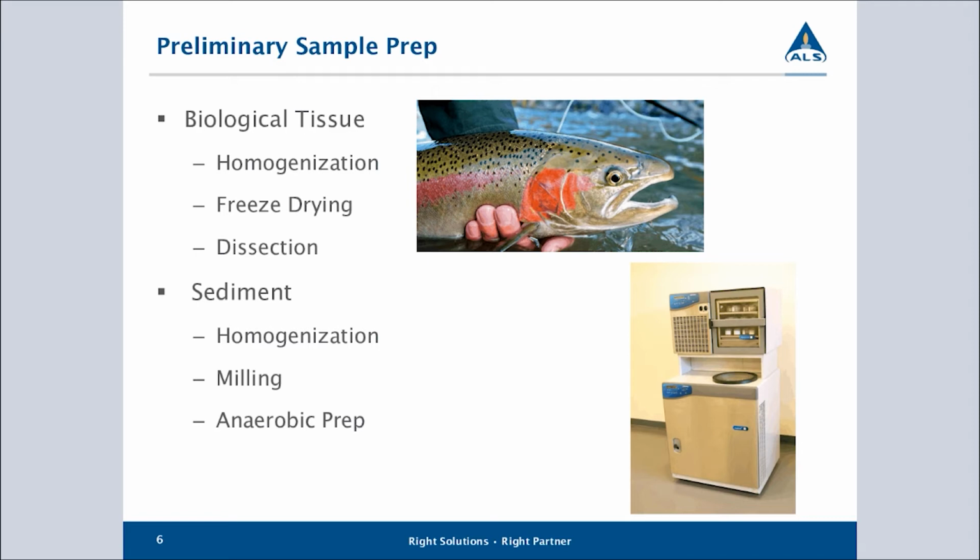Sediment samples are generally mixed in the received container, but we'll also put them in a larger container to get better mixing, particularly of supernatant water that may have separated out, when the client wants that mixed into the sediments. Drying of subsamples for organic analysis is really done by the conventional drying agents.